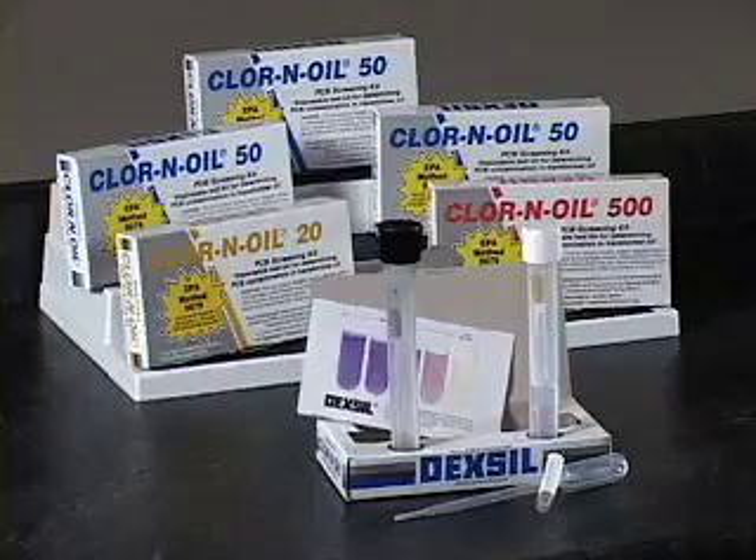The chlorine oil analysis is based on reacting PCBs with metallic sodium, which converts the organic chlorine on the PCB molecule to inorganic sodium chloride. In order for this reaction to work properly, an oil sample must contain less than 2% water.